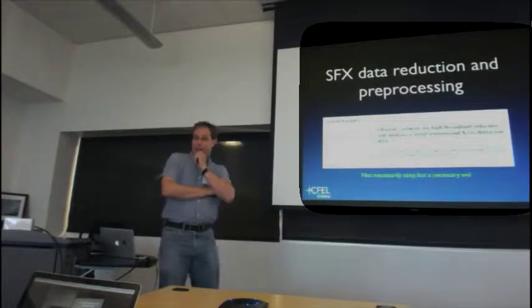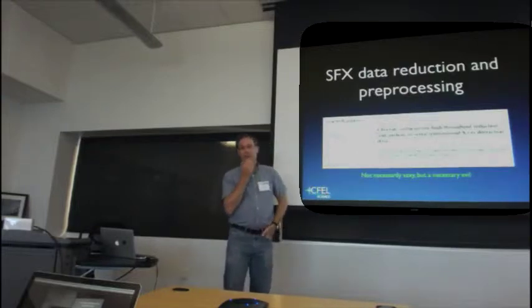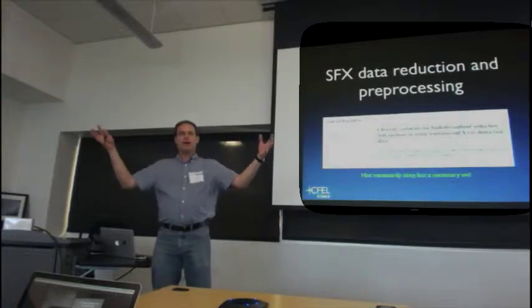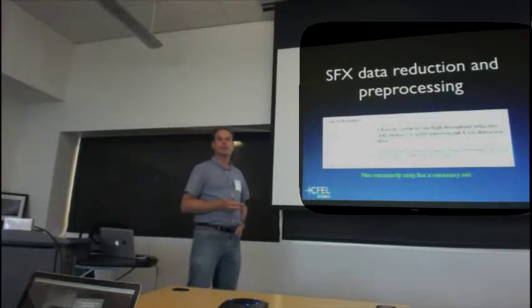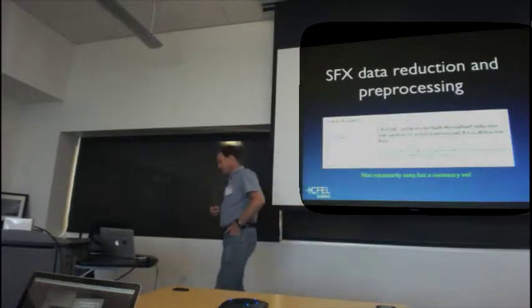It's not particularly sexy, you know, integration, indexing, all that stuff's much, much more interesting in many ways, but it's kind of a necessary evil because it takes you from data sets that are fairly large and unwieldy in strange formats into something that you can actually poke a stick at and start to do real analysis on in a reasonably efficient manner.